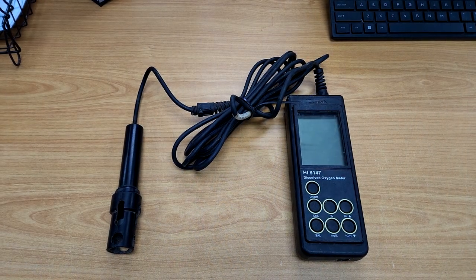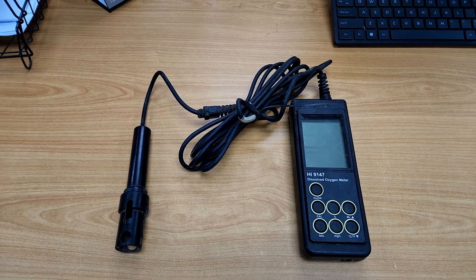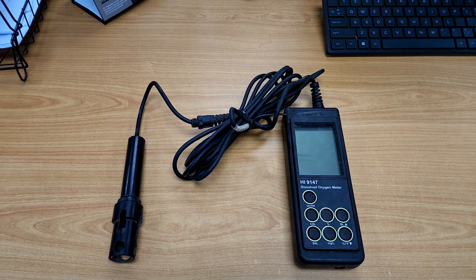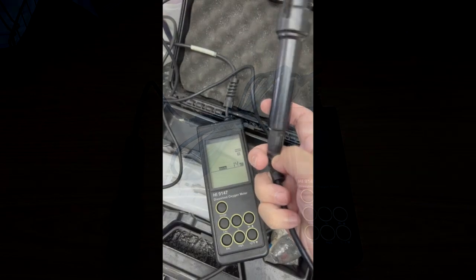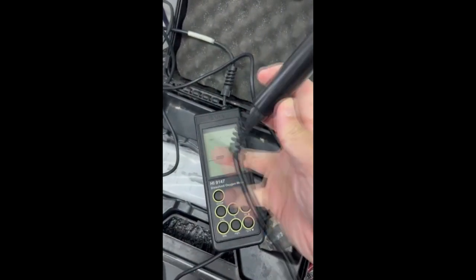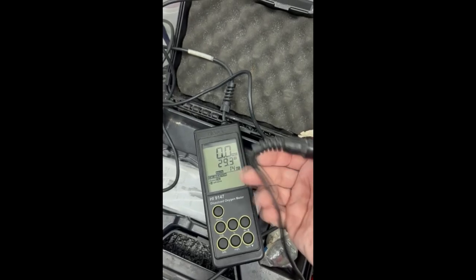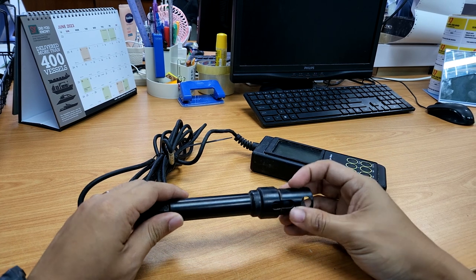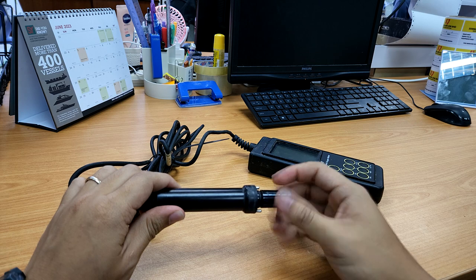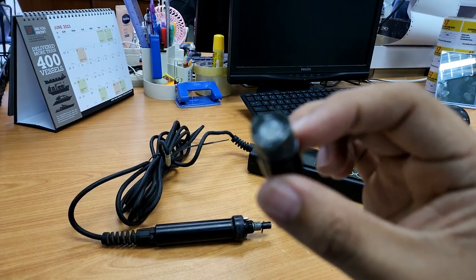On top of that, we also had a meter from a previous project that's no longer working because of issues with the probe. So we decided to buy a similar unit hoping we could reuse some of the spare parts in case of any failure. But only after using the new meter for about two months, this happened — we sent it back to the HANA technician, and you can see that one of the wires inside the probe has actually been damaged. The technician found that only at an extreme angle does the probe get a reading, which indicates a faulty line in the probe. The official advice from HANA was for us to replace the probe.